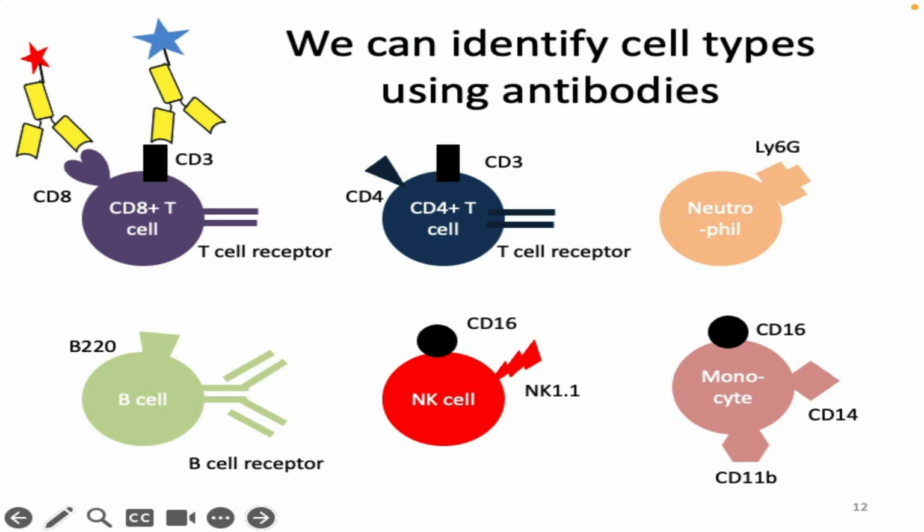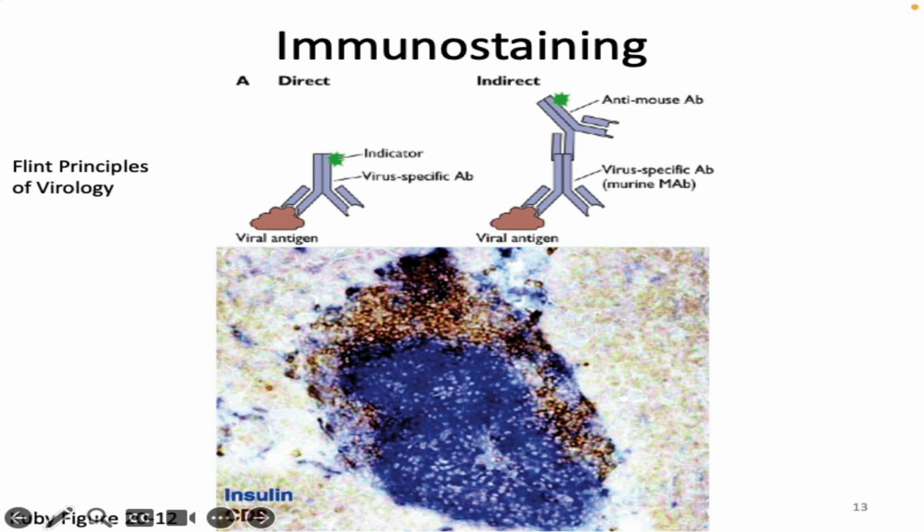If really all you're doing is, hey, let's look at cells under a microscope and see which color they are, that's not helping you with the speed at all. It's going to be just as long and just as annoying, even though, yes, you're getting more information. So the other useful part of this is that we have a machine that speeds this whole business up. And that machine is called a flow cytometer.